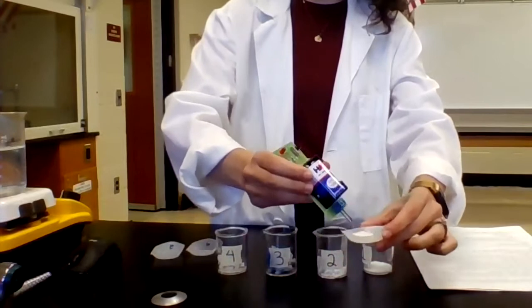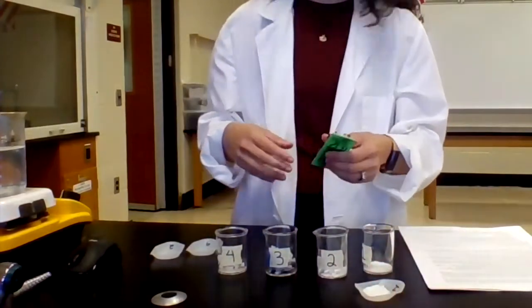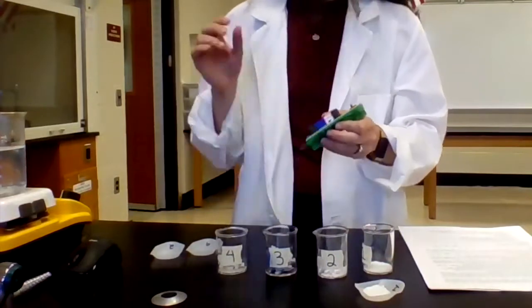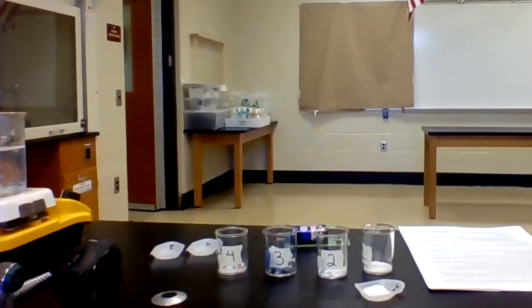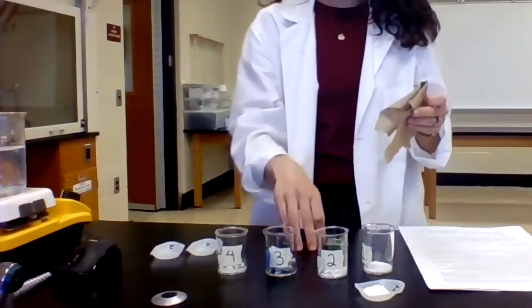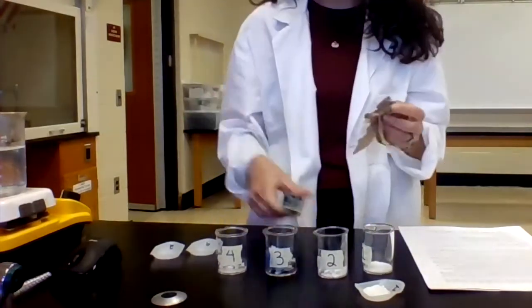So solid 1, not able to conduct in the solid state. Okay, now I'm going to wipe this off. Let me grab a paper towel. We don't want to contaminate our solids.